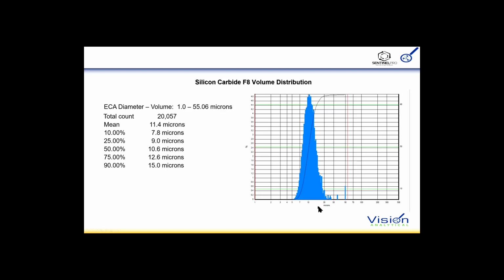This is the volume distribution. It shows particles at 50 microns. This is the percentage of volumetric particles that it represents, and these are the microns in volume. So this says we do have a 50 micron particle. We have some here at 35. We've looked at 20,000 particles in this particular case. We're using the Particle Insight, but we're representing it as if it were a laser result.